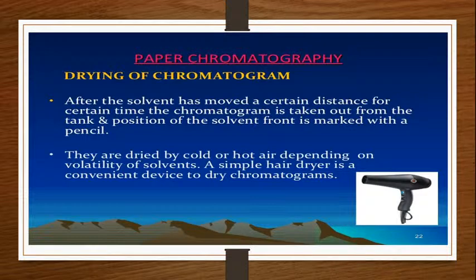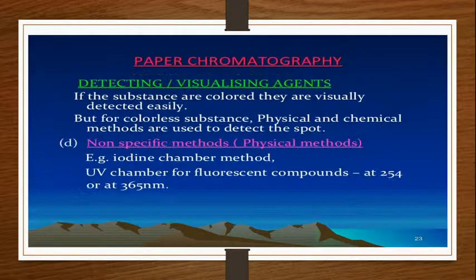So after drying of the chromatogram, what next? Next is the visualization, or what in analytical terms is called detection. Remember, detection is the next technique. In paper chromatography, it is more of using visualizing agents rather than detection.